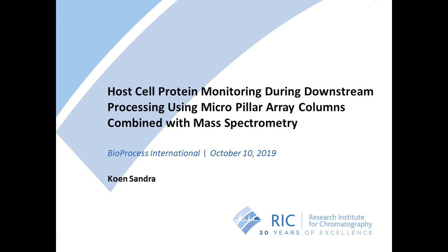Okay, thank you, Geert, for this very nice overview of the µPAC technology. So in the next 10 to 12 minutes, I will demonstrate how we at RIC have used this technology in host cell protein monitoring, and more specifically during the downstream processing of a therapeutic monoclonal antibody. Before showing the performance of the column in host cell protein analysis, I would like to start by providing you some more context here.